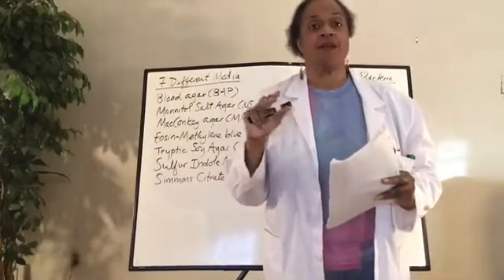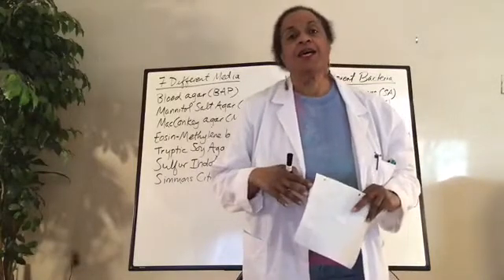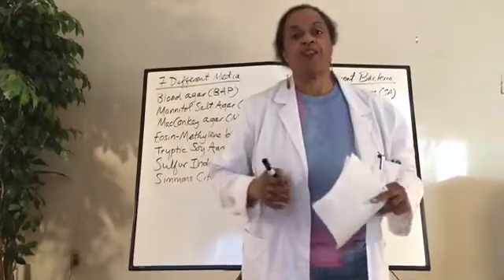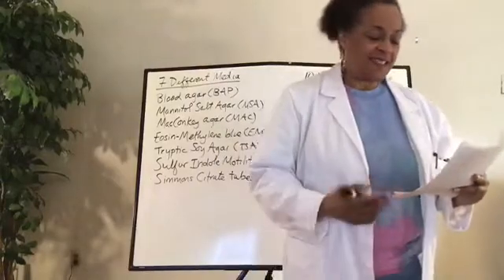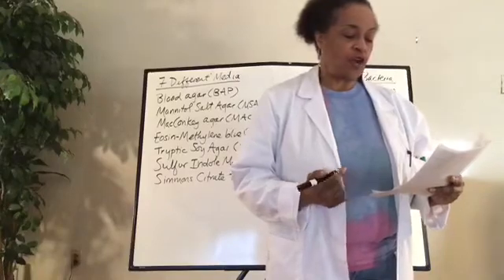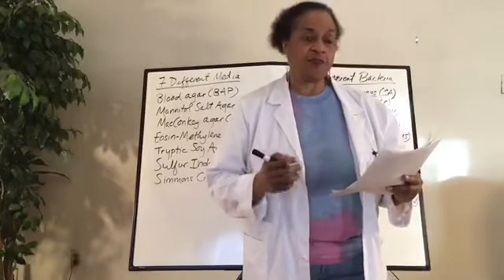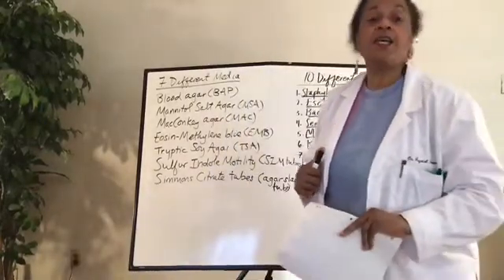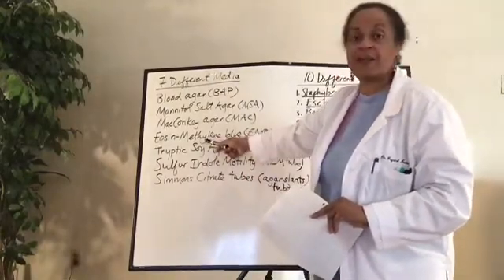Both genuses are the same. Both are Staphylococcus, but the species are different. This is where you could put a lot of bacteria in a container and start plating them, and a selective medium will show you even the difference in the species. Sometimes antibiotics, dyes, and various inhibitory compounds are incorporated into the media to create selective conditions for growing specific organisms. When we say sometimes dyes are put in the media to make sure that only certain organisms grow, we'll see that example with eosin methylene blue.